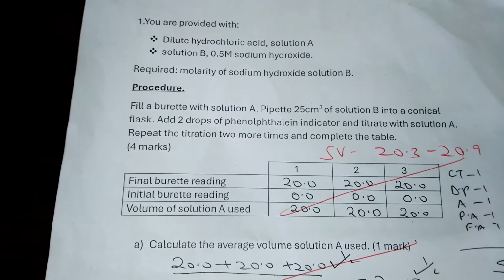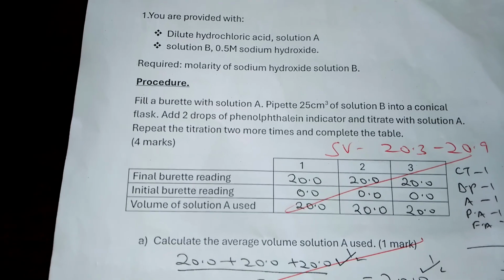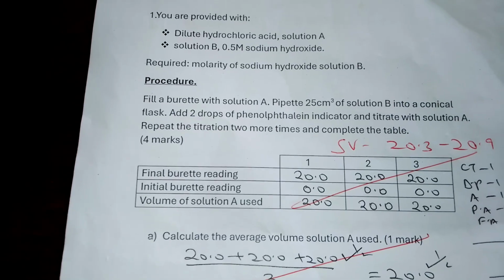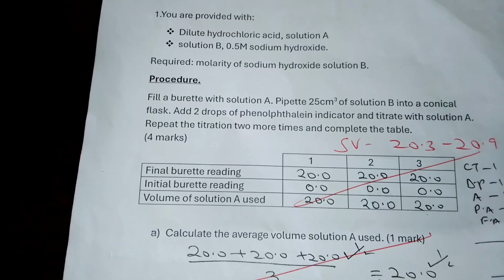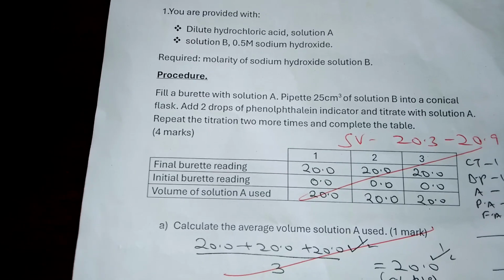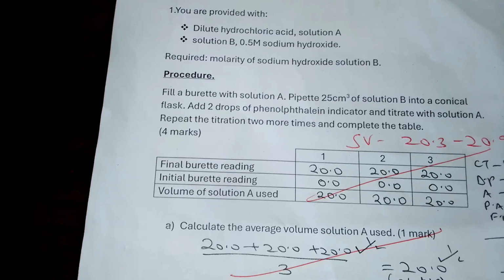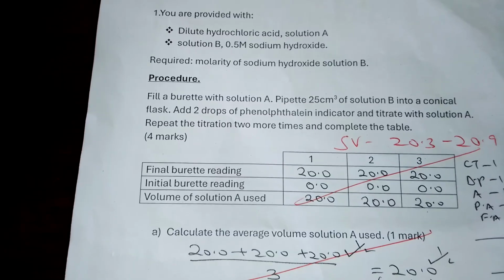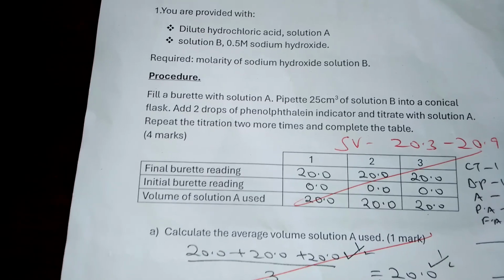So this practical was done, and the titre volume was in the first column. The end point came at 20.0 cubic centimeters, and then on the second column, the second titration, after it had been done, they refilled the burette after they had titrated from 20, and then they refilled to the 0 mark, and then they titrated, and they also got 20.0 cubic centimeters. The same applies to the third column.